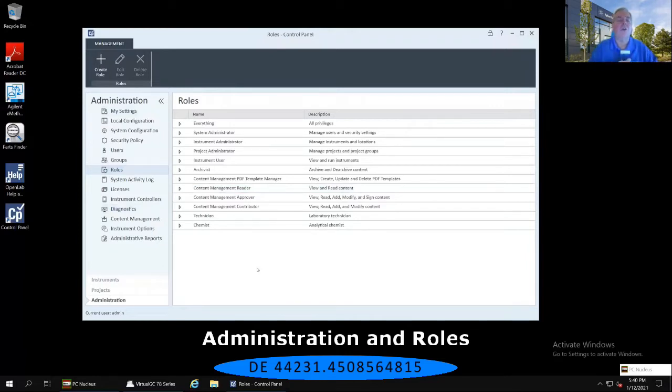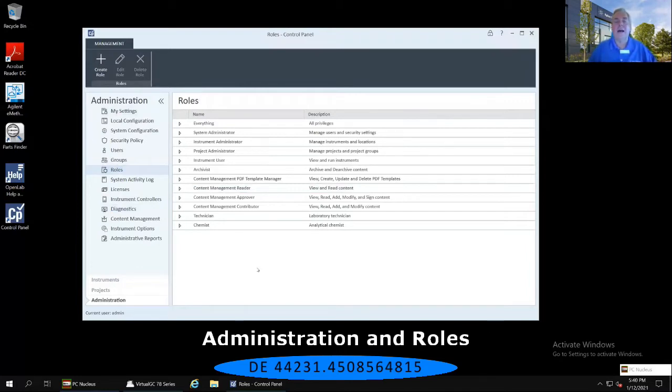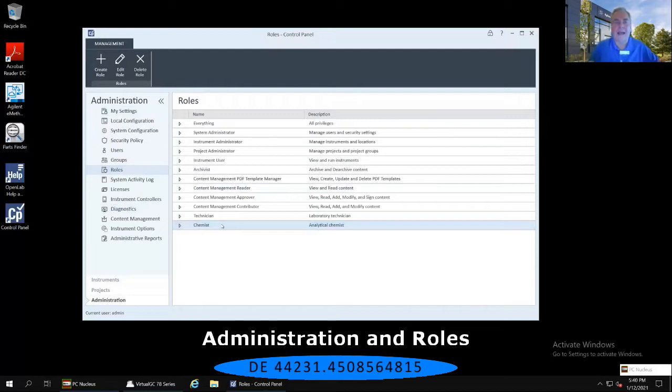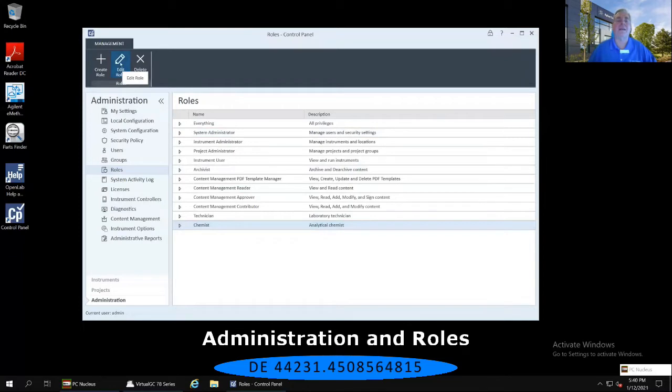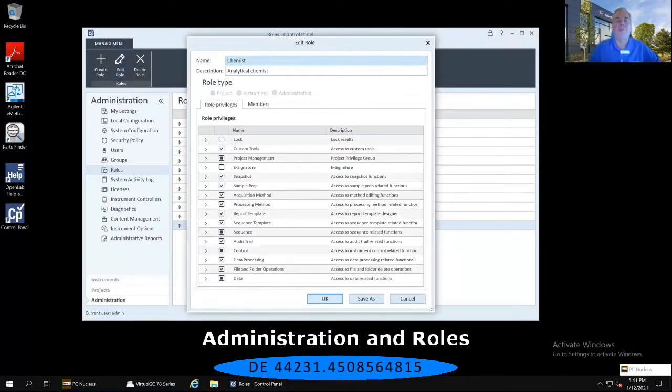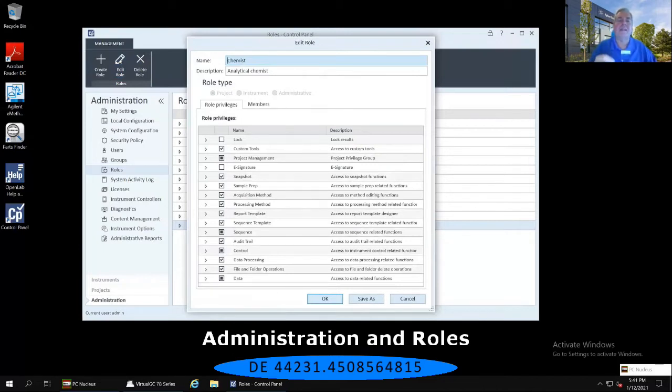Now, I'd like to call your attention specifically, while you have the roles highlighted on the left, highlight the Chemist role on the right-hand panel. And then in the upper ribbon, in the black space, I want you to select the second icon from the left that says Edit Role. Now, this is a blow-up of all of the different capabilities or privileges that this particular role has been assigned.